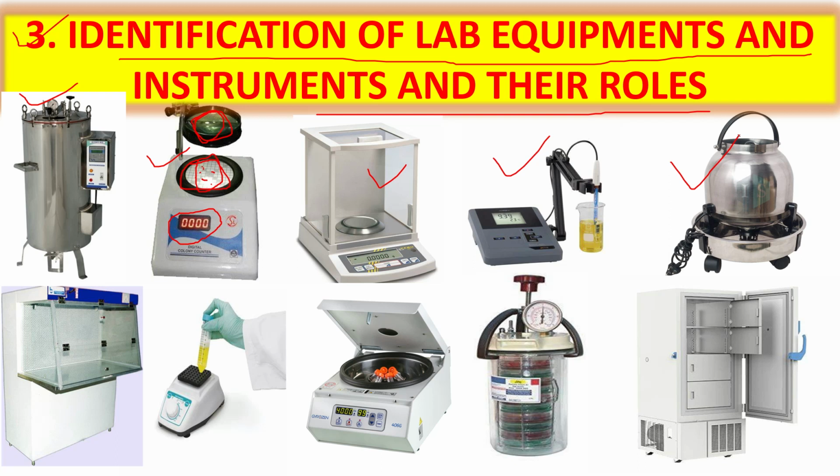Suppose a room where any type of organisms or microorganisms are worked with in a laboratory. So you have to fumigate the room at least once in a week, so that the room is not contaminated with many types of microorganisms. If the room is contaminated with many types of microorganisms, then it can hamper your experiment or test. So that's why we have to perform fumigation.